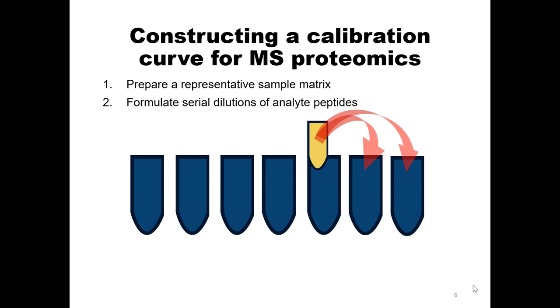Yeah. So this is confusing because Skyline has a calibration, and I think Skyline calls it a curve, but this is for a different application, right? This is not to convert peak area to different units. This is to calculate the LOD and the LOQ, if that was unclear. This is kind of the more conventional definition of a calibration curve, for calculating figures of merit, LOD and LOQ.